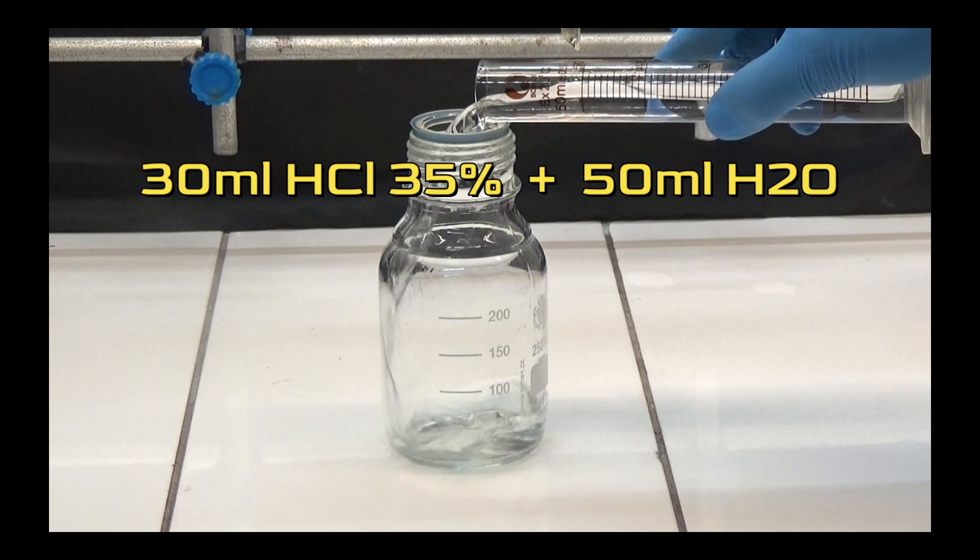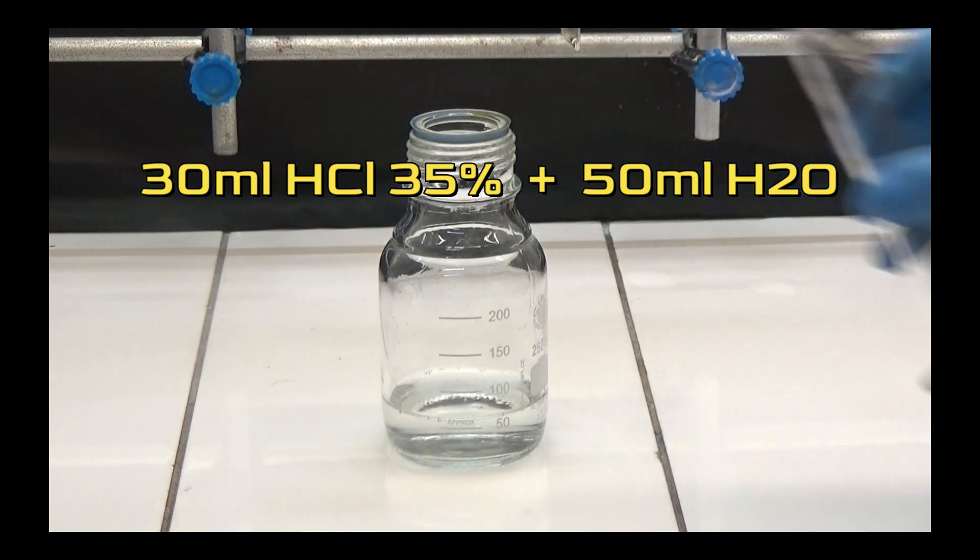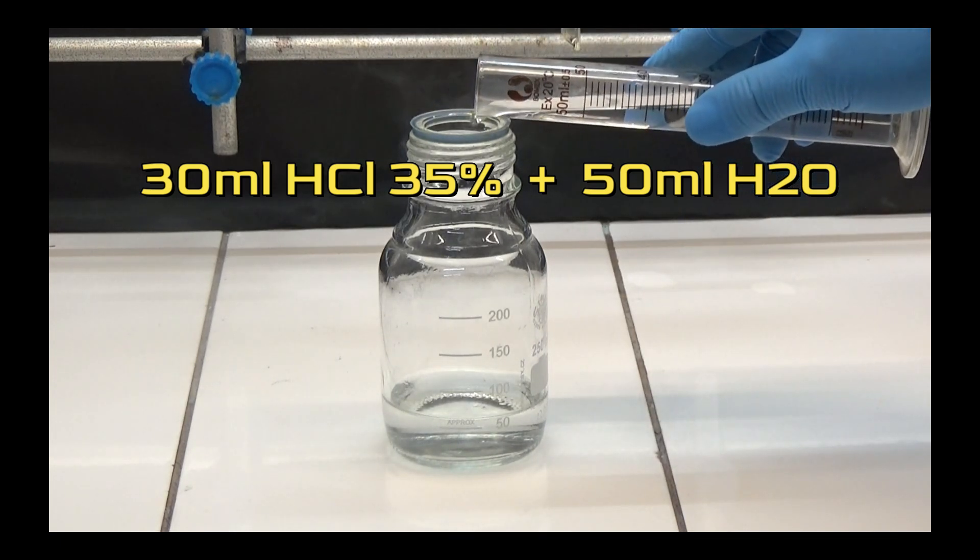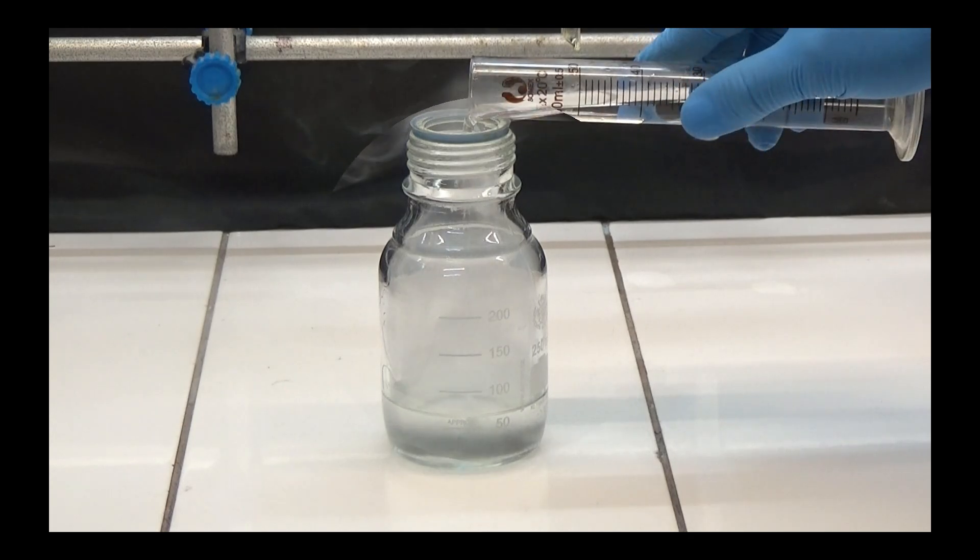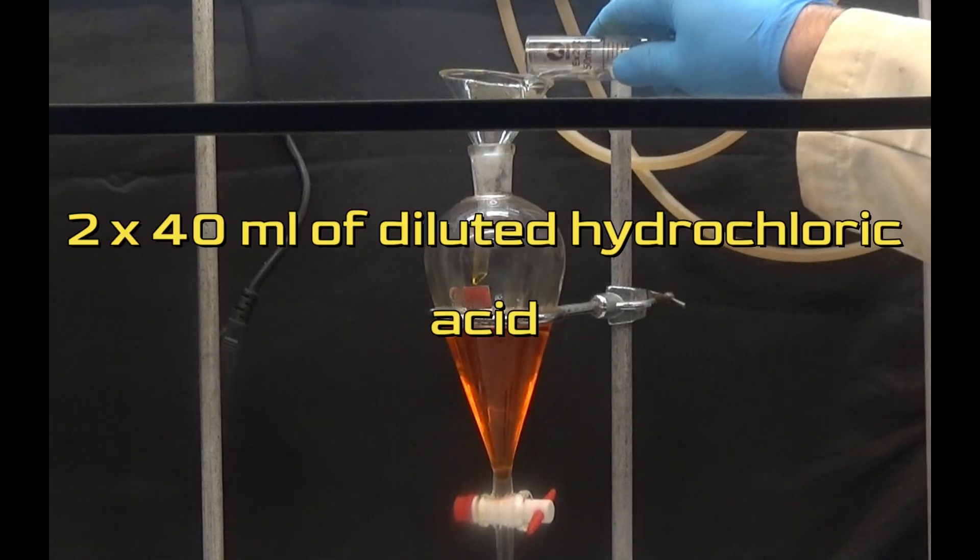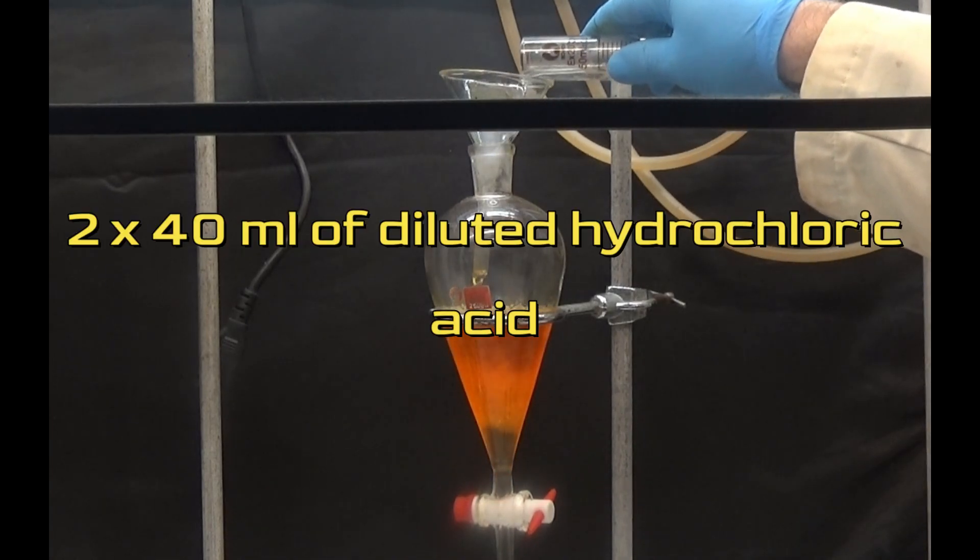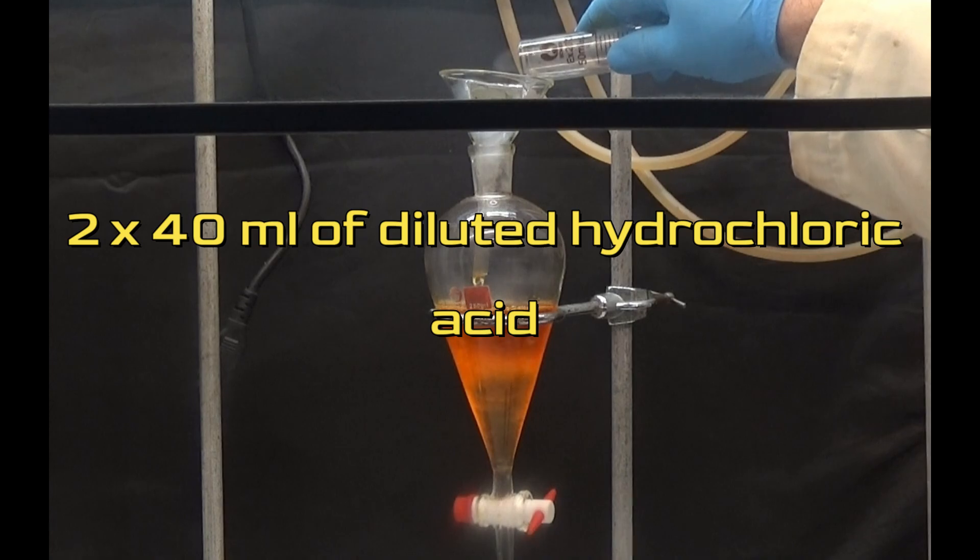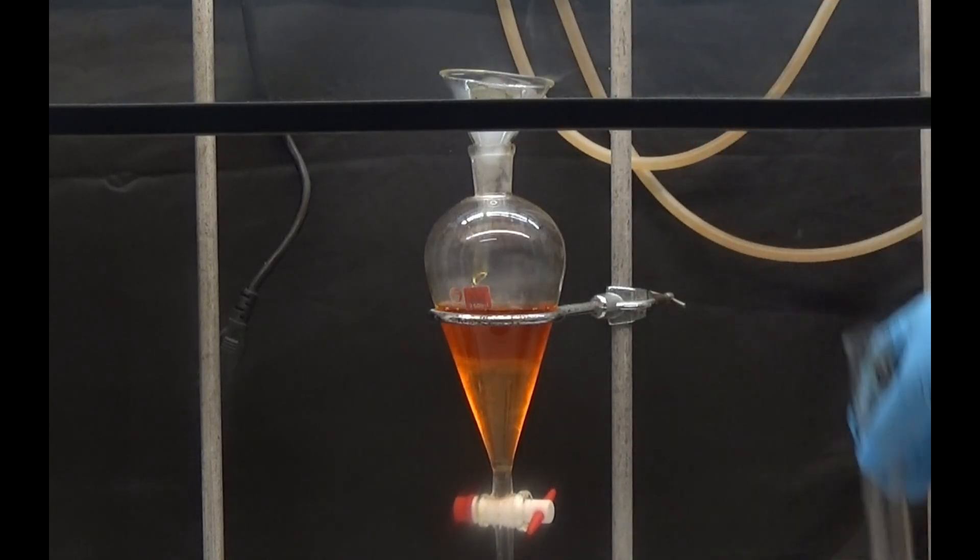Prepare diluted hydrochloric acid by dissolving 30 milliliters of 35 percent acid in 50 milliliters of water. The organic ether phase was cleaned by using 2 by 40 milliliters of diluted hydrochloric acid in a separating funnel, and each extraction was shaken for five minutes.